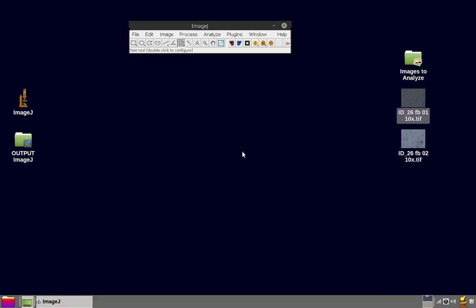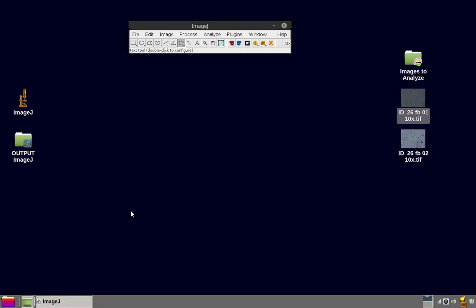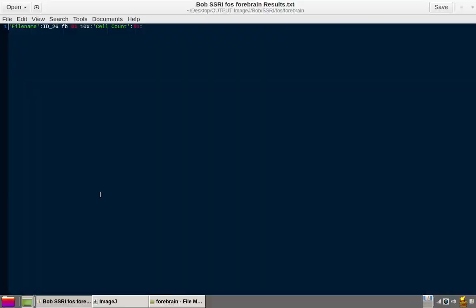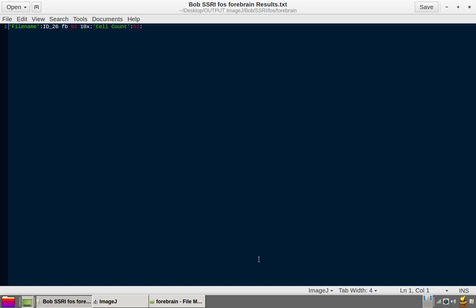Press keyboard shortcut F12 again to open the current user folder. And you can see that a new folder has been generated based on the image name. And check the results file. Note that a results line has been added with a cell count of 51.